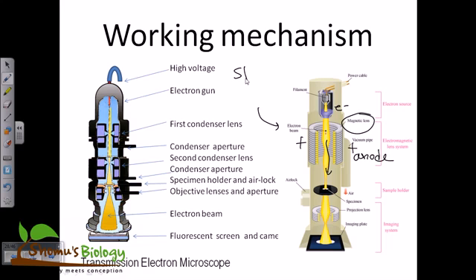So we call it a spatial variation, right, due to the partial scattering or partial transmission of the beam. The image we get from the spatial variation is carrying the information, and that information is not enough to be recognized by the CCD. So we require another type of lenses, as you can see in the second set of lenses, which will amplify that signal, right?